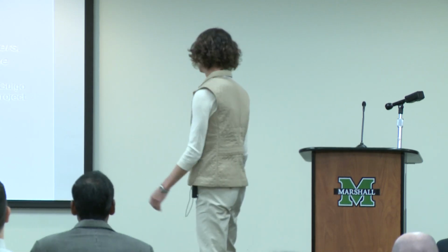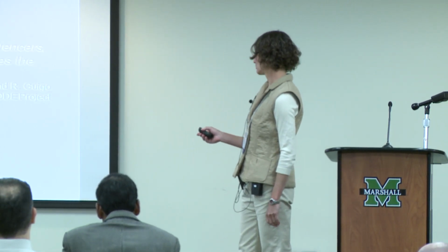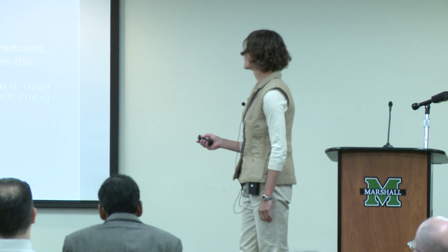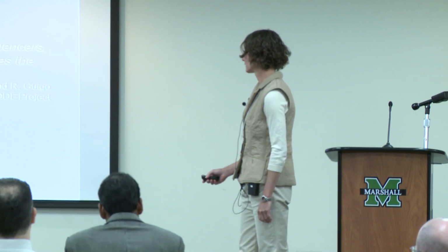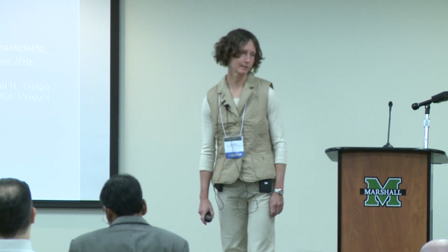encapsulates how a classically trained molecular biologist might find herself giving a talk at a cyber infrastructure day. Besides high-throughput machines such as sequencers, the computer and its associated software has become the instrument to observe the genome.